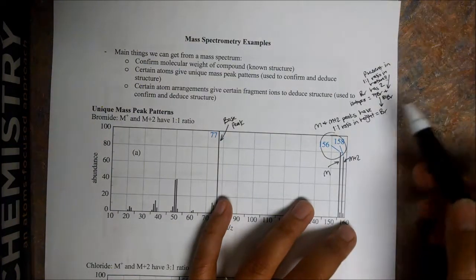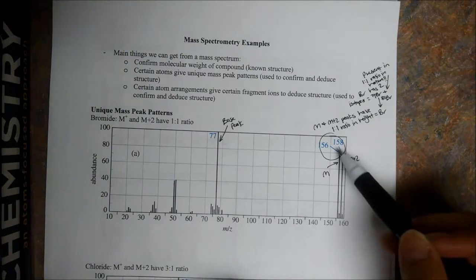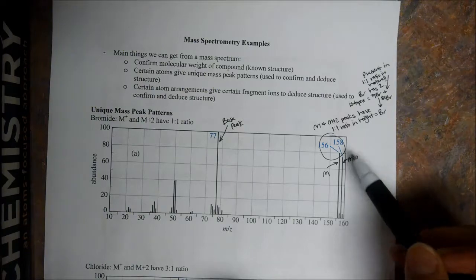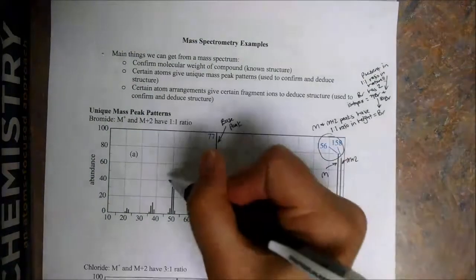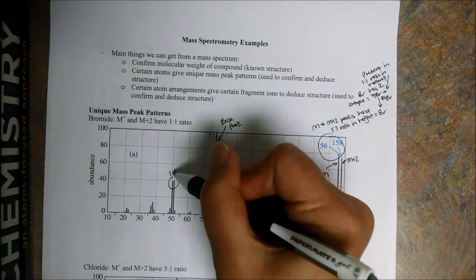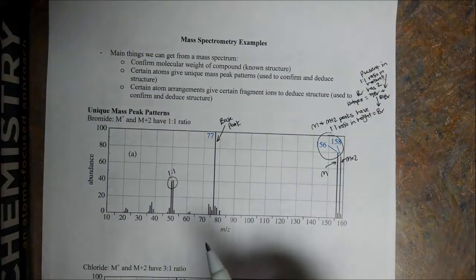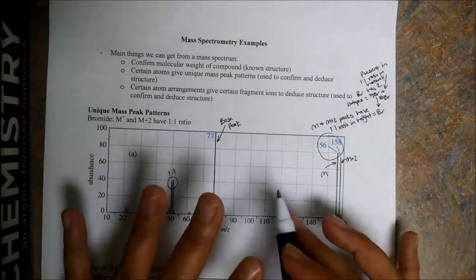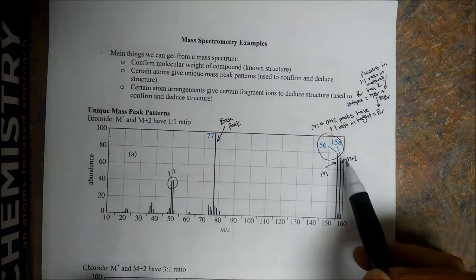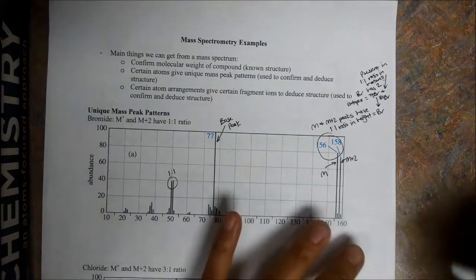Okay, so again, they just correspond to the different bromines in our sample. This compound has a bromine in it. That's why we have an M and an M plus 2, about 1 to 1. And we can see that this actually repeats as well. Here it is again, another 1 to 1 ratio. So this ion also has a bromine in it. These are indicative of bromines. We're going to have our molecular ion and an M plus 2 peak, each with a 1 to 1 ratio in height. This is indicative of bromine.